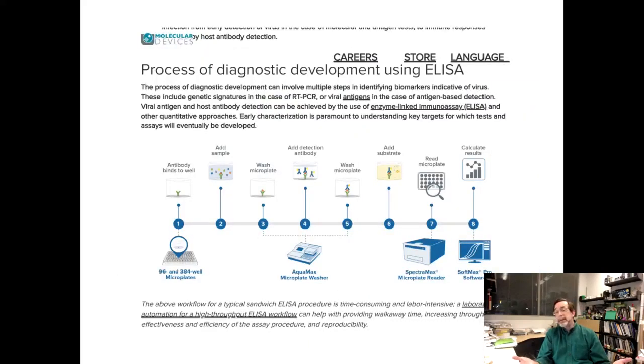Now this is big business. There's some devices that will do this for you. These are the regular lab devices that will do ELISA for you, the different steps. And the only thing I want to say is these were automated and put in a robot, so that can run 24/7. But it still needs humans to run it, to set it up, and to fix it when it breaks.